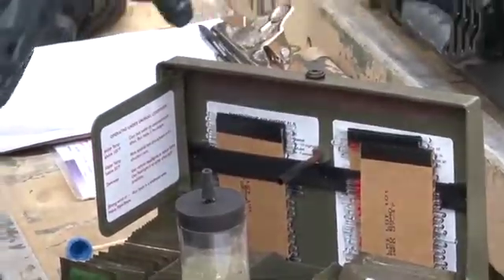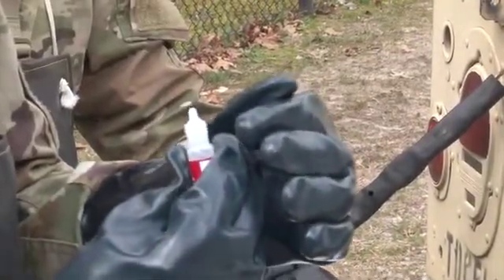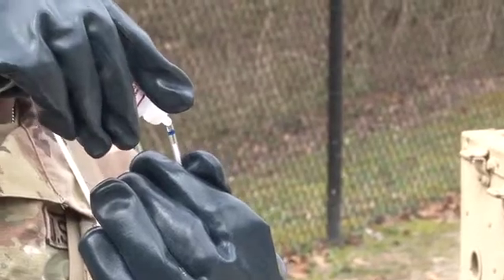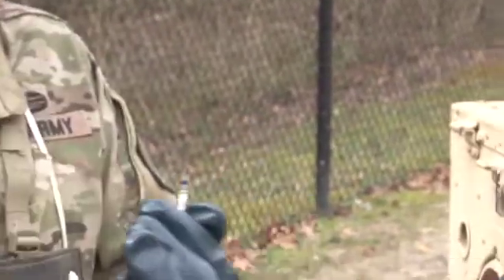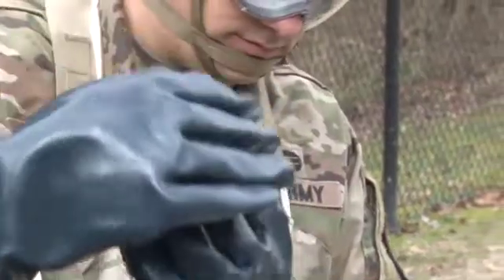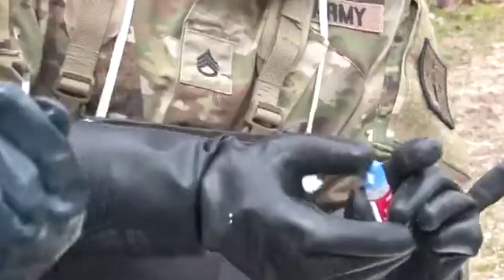Remove the blue band tube from the tube holder. Hold the tube with the prongs down. Press the bottle tip against the blue band end of the tube and squeeze 1/4 inch of the alkaline solution into the tube end. Now tap the tube with your finger. Twist the cap firmly onto the alkaline solution bottle and return the bottle to the kit.